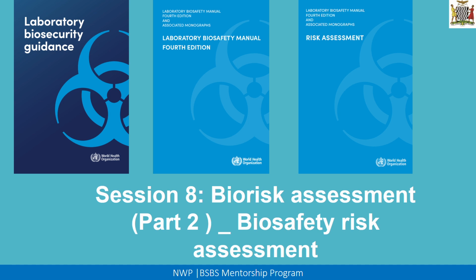We're saying risk is a combination of likelihood and consequence. So we're going to look at what will affect the likelihood if you're doing a biorisk assessment just for biosafety, and also what affects the consequence.